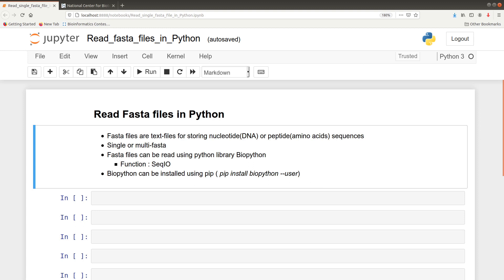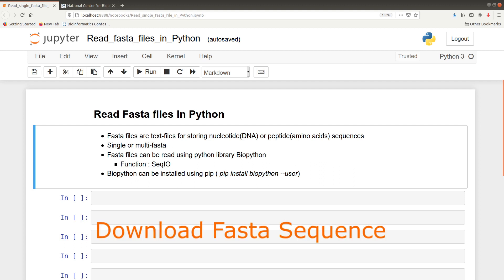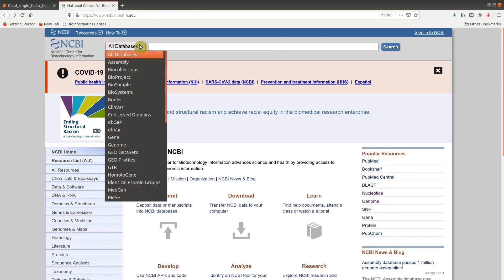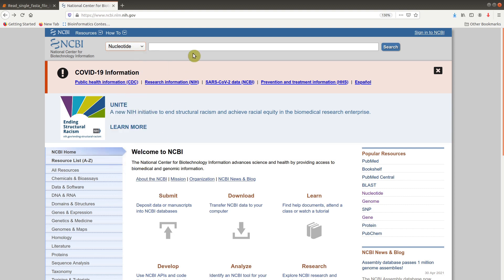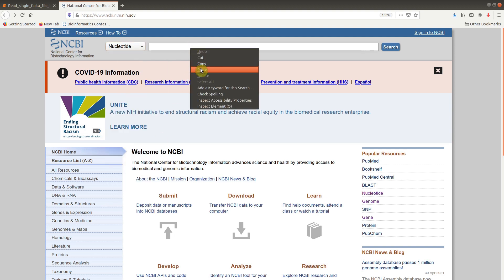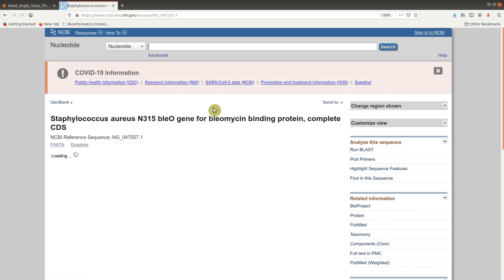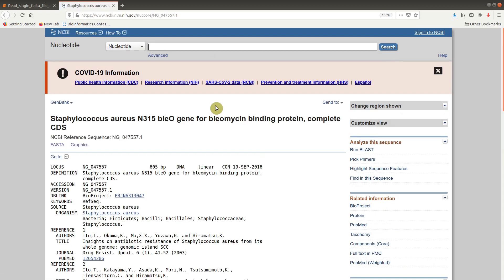We are going to begin by first downloading and reading a single FASTA file that contains a single record. So we first go to NCBI, that's the home page, and we select nucleotide. Then we will use the accession number NG_047557.1. This particular sequence is the nucleotide sequence of a gene responsible for antimicrobial resistance in certain bacteria strains or organisms.